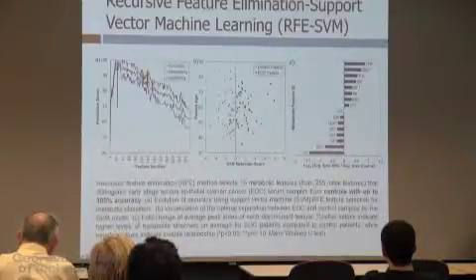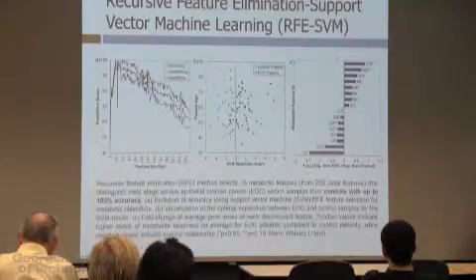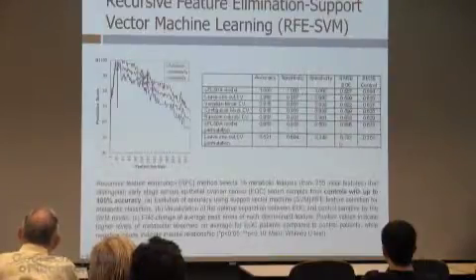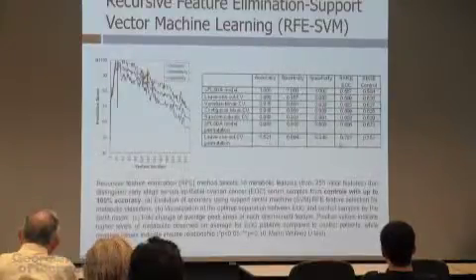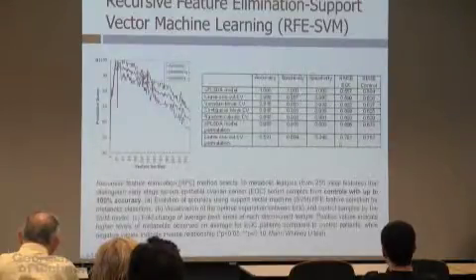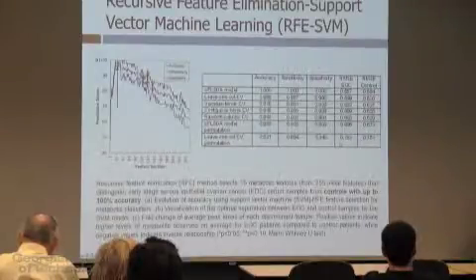The metabolites involved, again, they go up and down, okay? There's a change in both directions, and we spent a ridiculous amount of time also validating this model to make sure that we're not fooling ourselves, so we tried different types of classification. We tried different types of what's called cross-validation. Cross-validation is interesting. You take samples in and out to pretend that you don't know what they are. You try to predict them and you see if you did it right or not. And you go back and forth, and you do that over and over again. And the accuracy ranges from perfect in the most optimistic case to around 90% in a more realistic case.